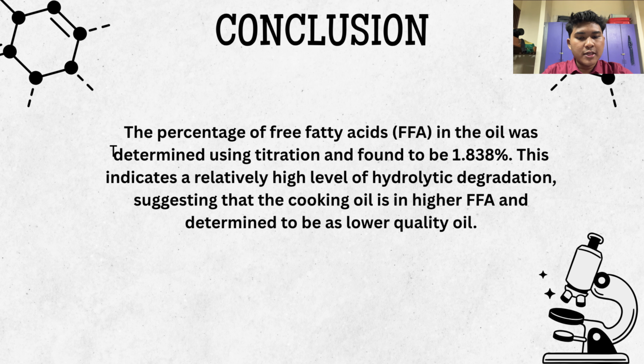So for the conclusion, the percentage of free fatty acids, FFA, in the oil was determined using titration and found to be approximately 1.838%. This indicates a relatively high level of hydrolytic degradation, suggesting that the cooking oil has a high FFA and is determined to be a lower quality oil. Thank you.